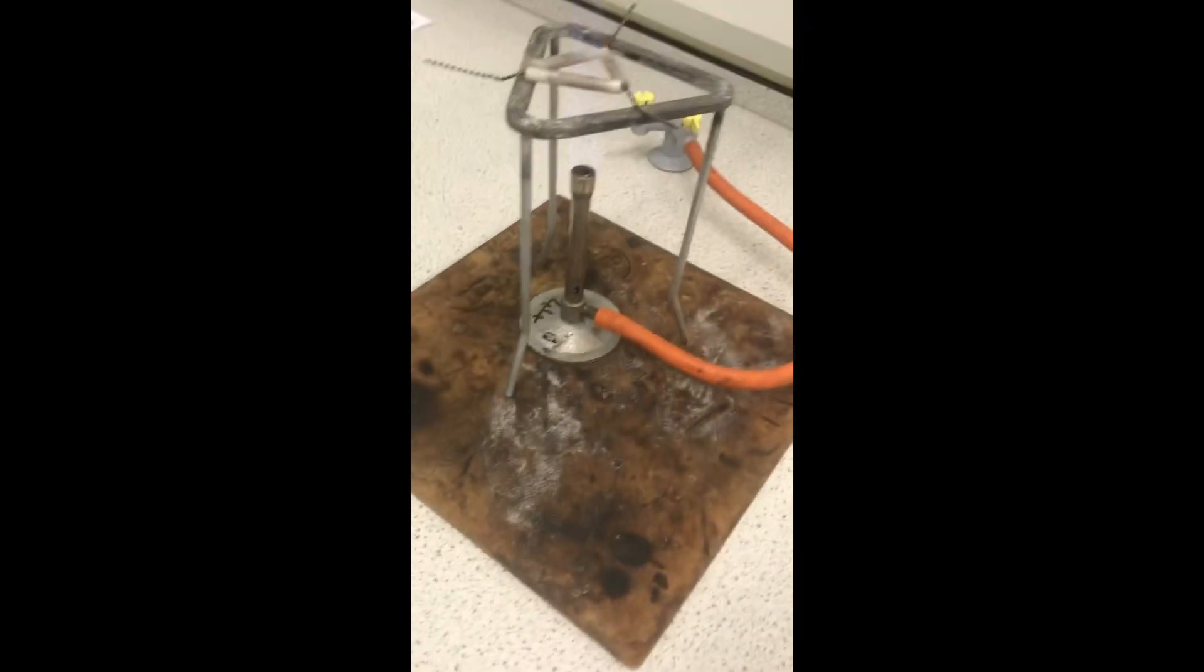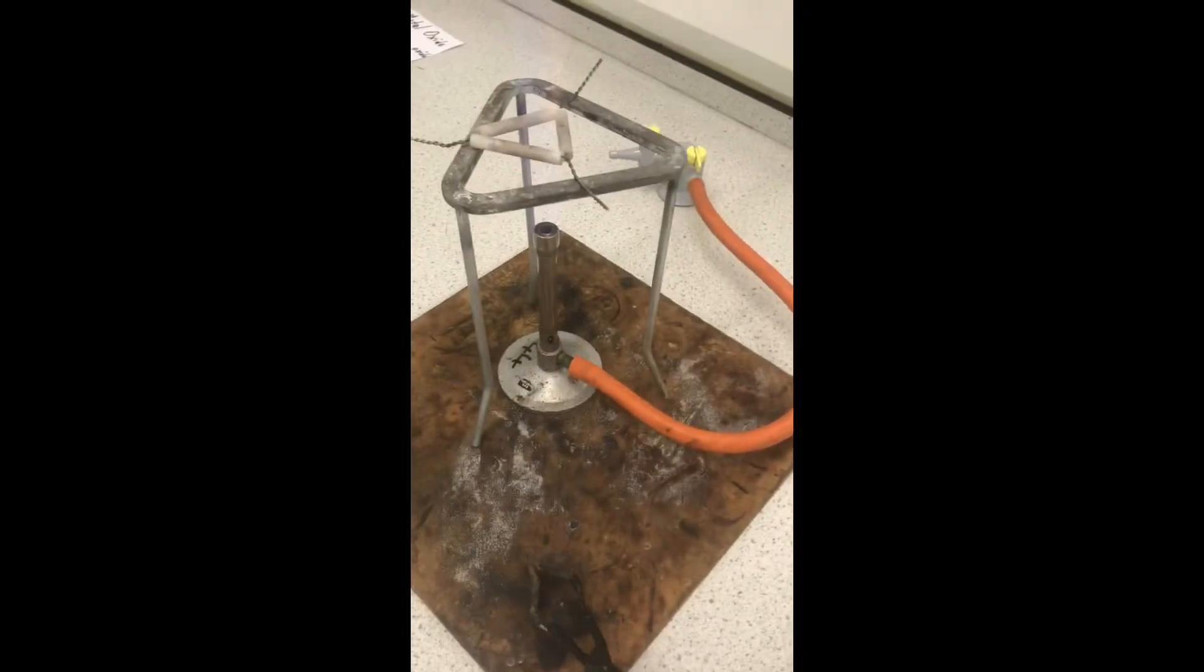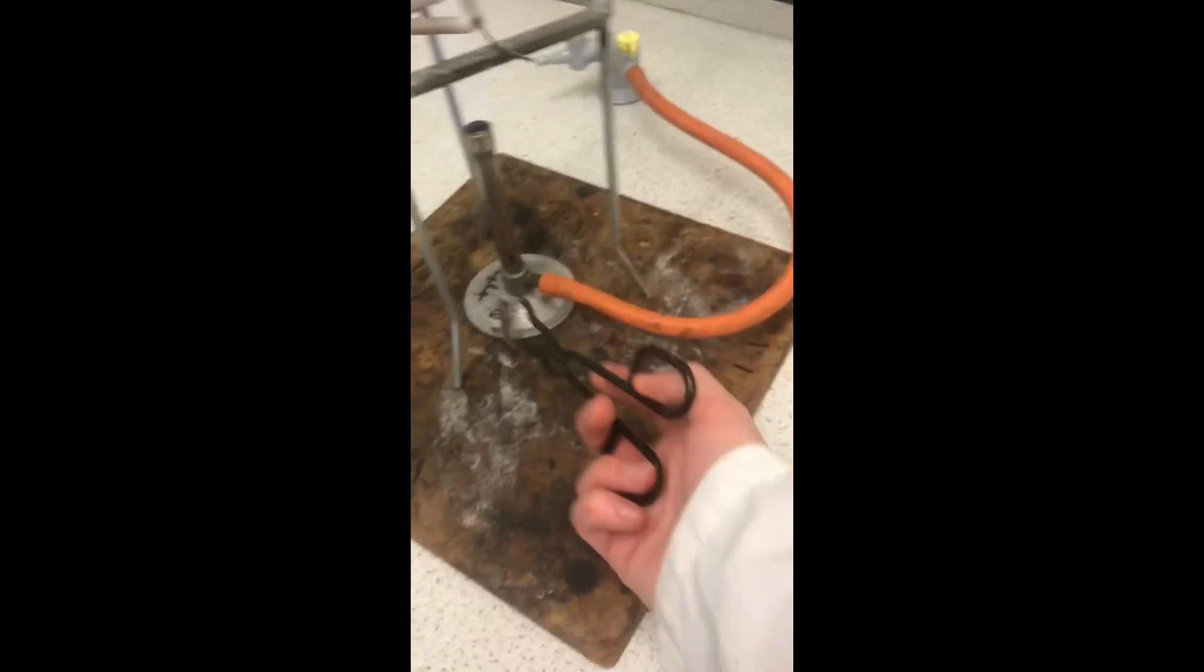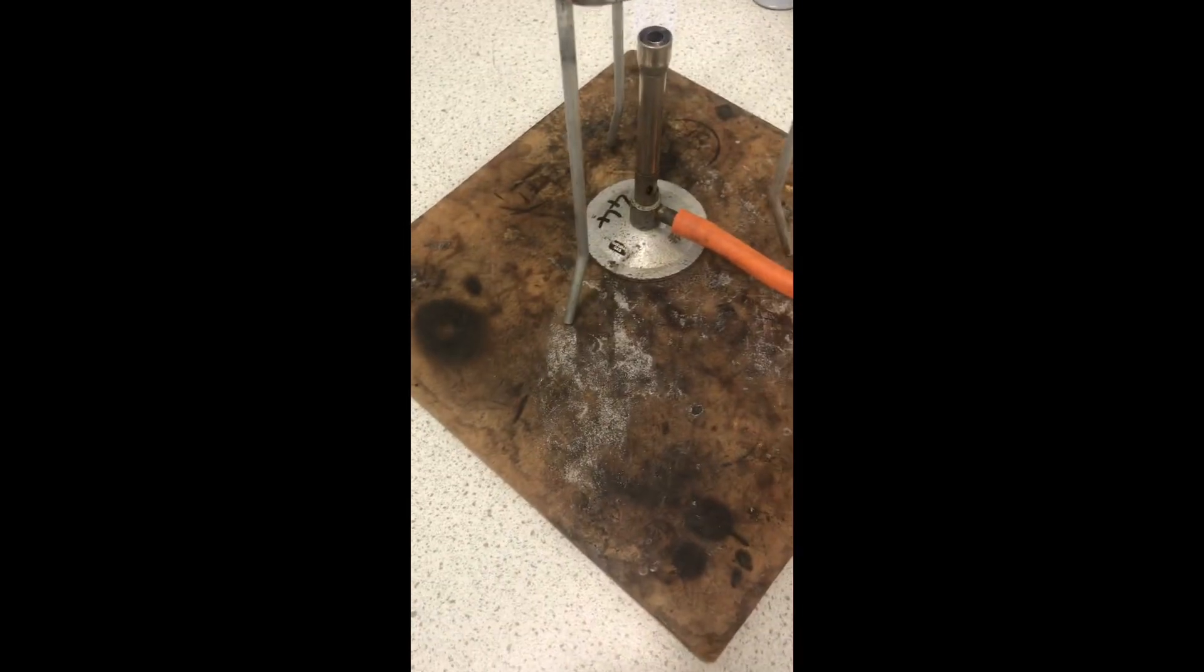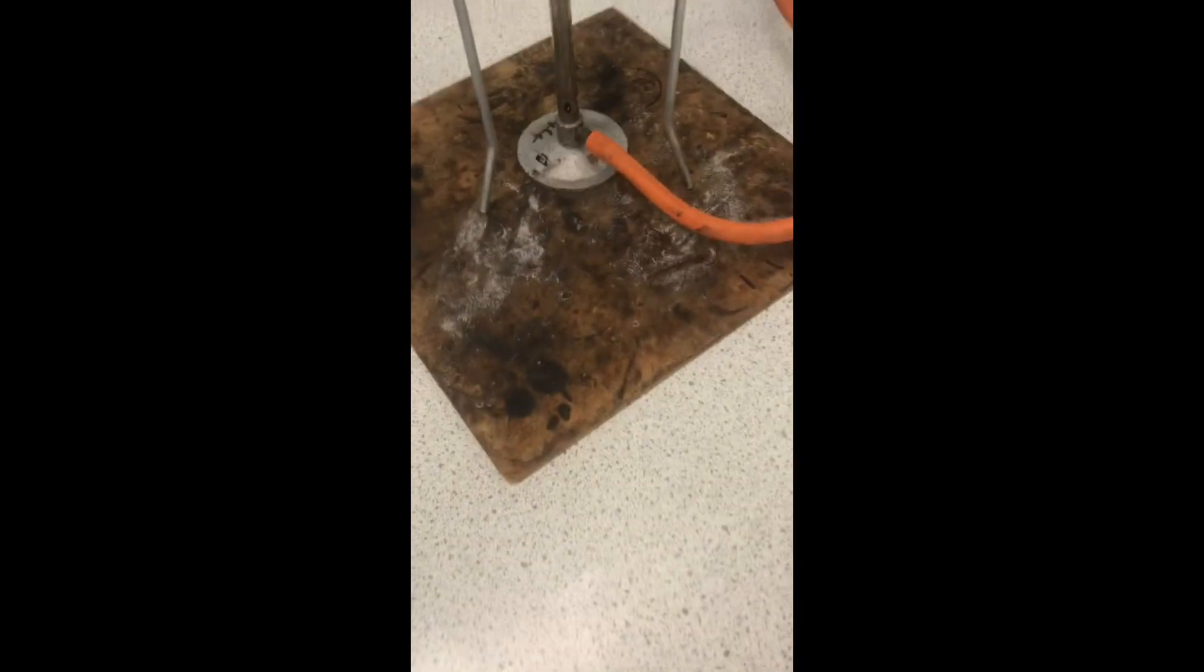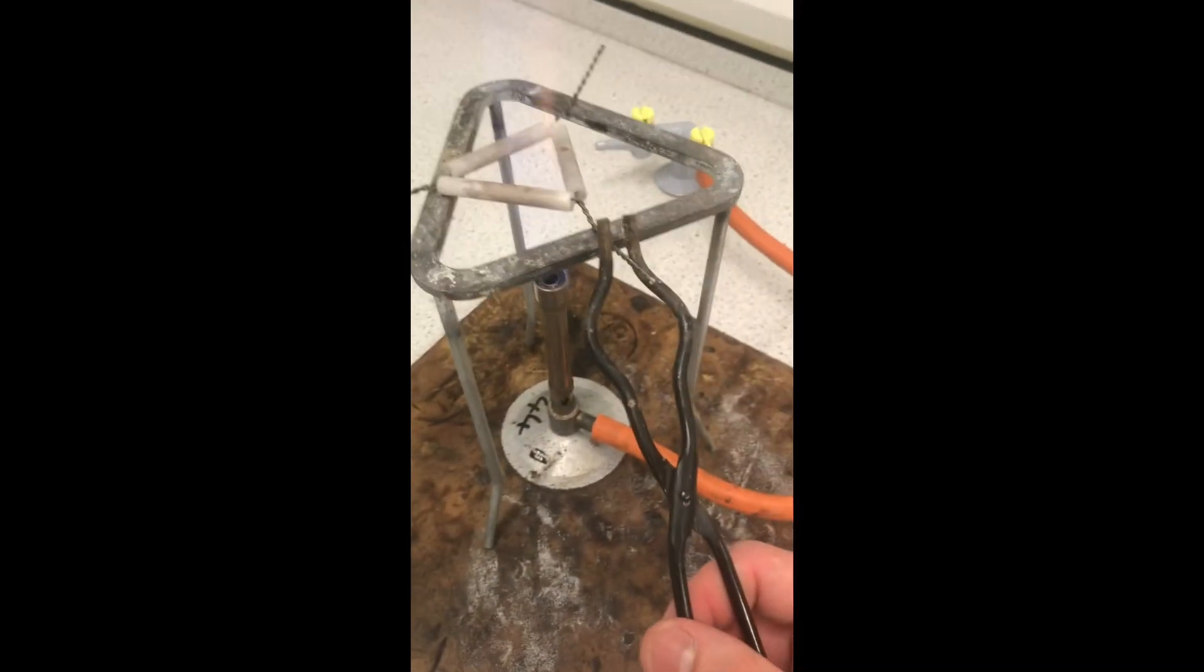So, for my setup for this experiment, we have a heatproof mat with a Bunsen burner, a tripod, and a pipe clay triangle. This is to hold our crucible.